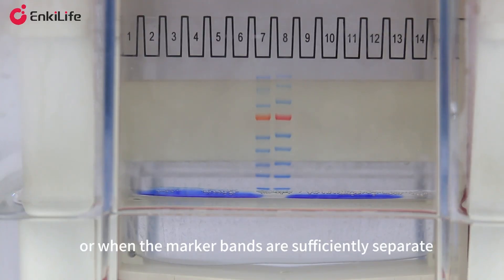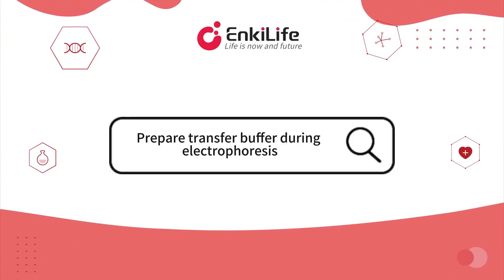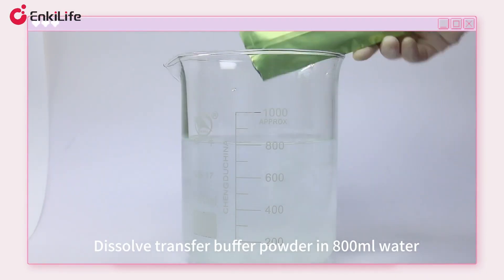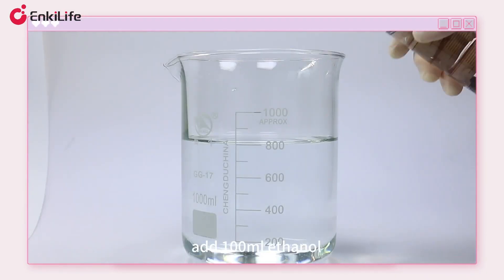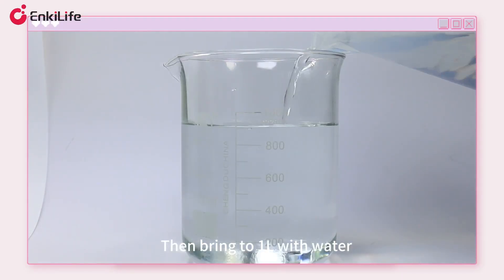Stop when the dye front reaches the gel bottom or when the marker bands are sufficiently separated. Prepare the transfer buffer during electrophoresis: dissolve transfer buffer powder in 800 milliliters of water, add 100 milliliters of ethanol, then bring to one liter with water.